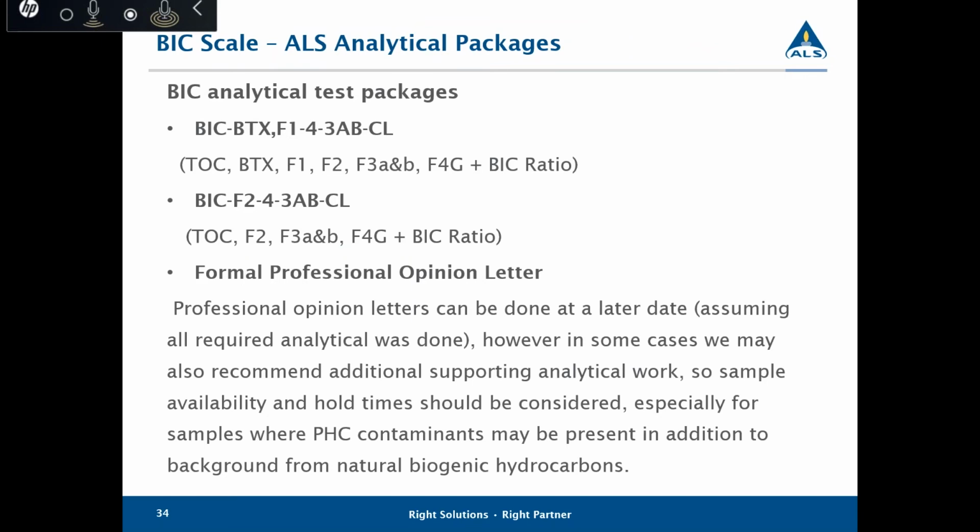So ALS is providing analytical packages to calculate the BIC scale. Currently we provide 2 analytical packages. One includes the BTEX, F1 to F4 analysis with the F3A/B split, calculating BIC ratio and TOC analysis. And the other package provides only the analysis and results for the extractable hydrocarbons.